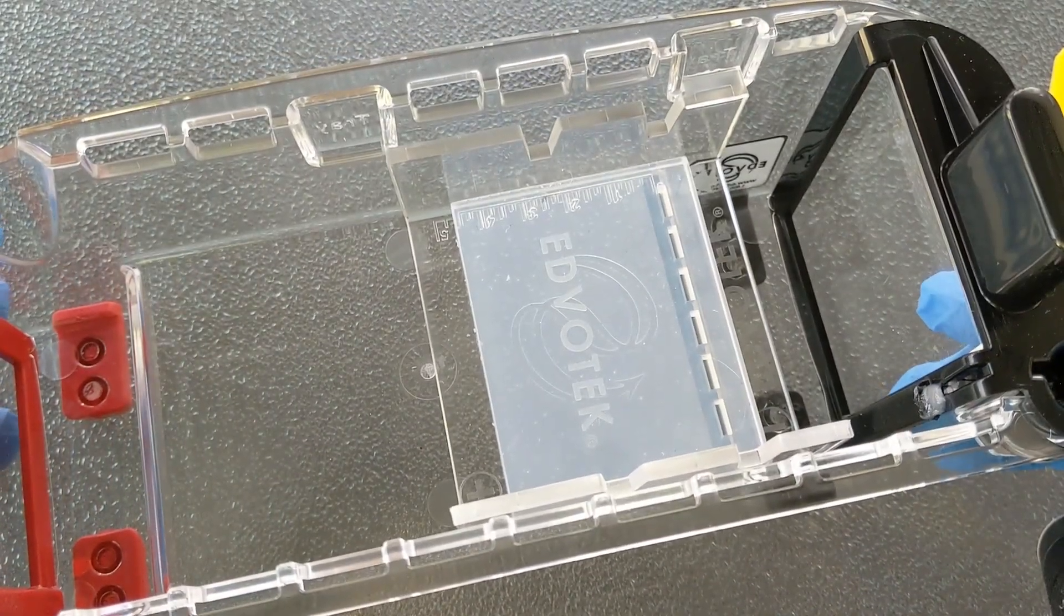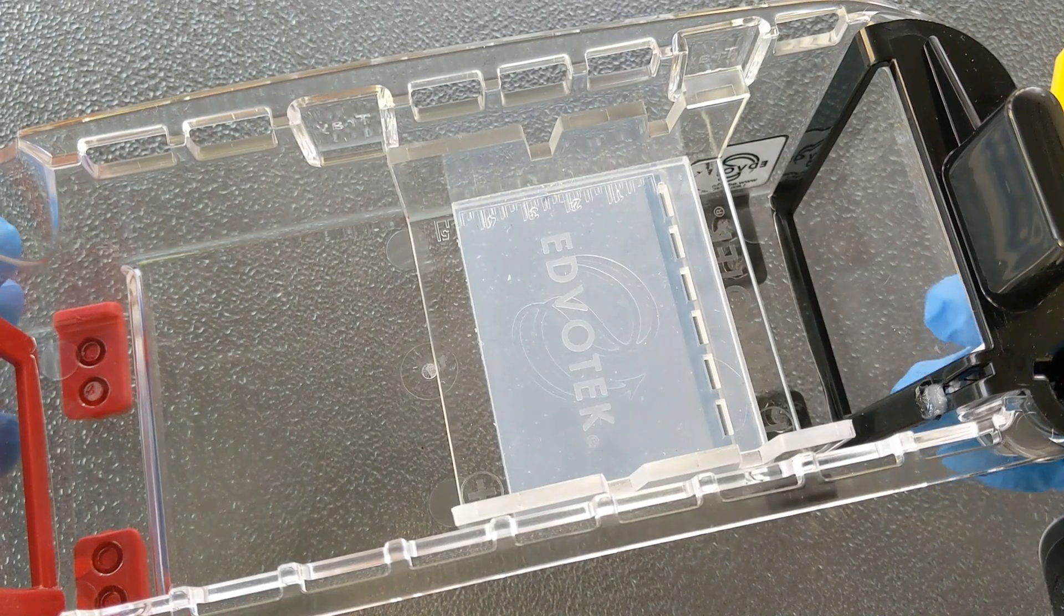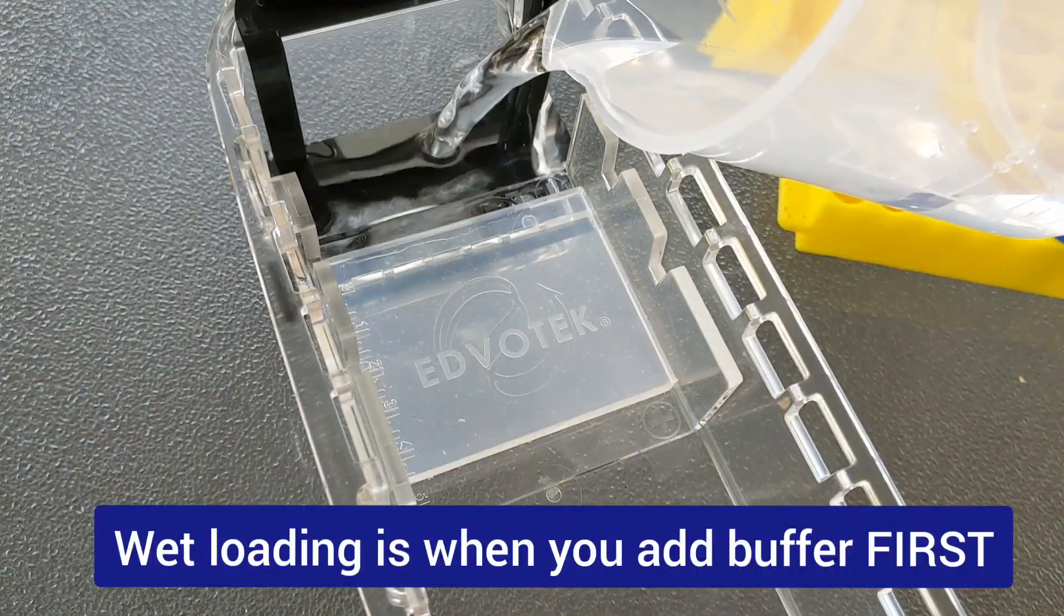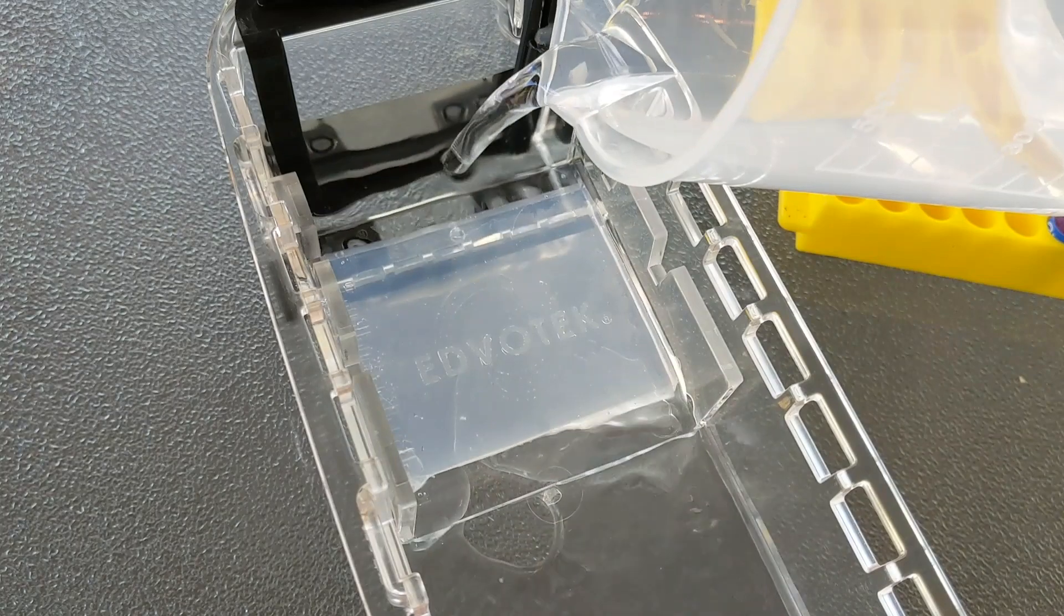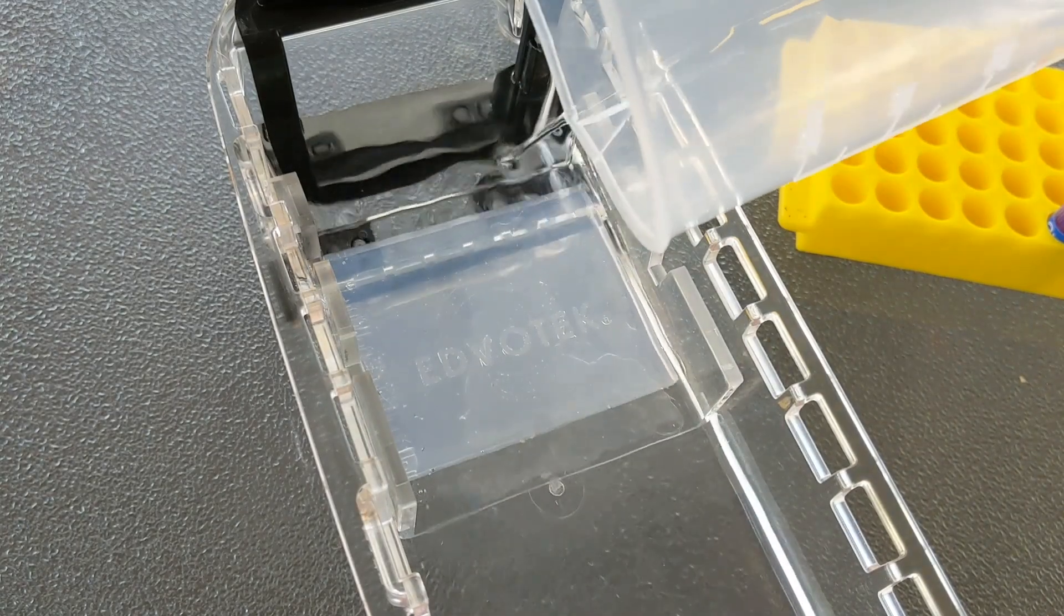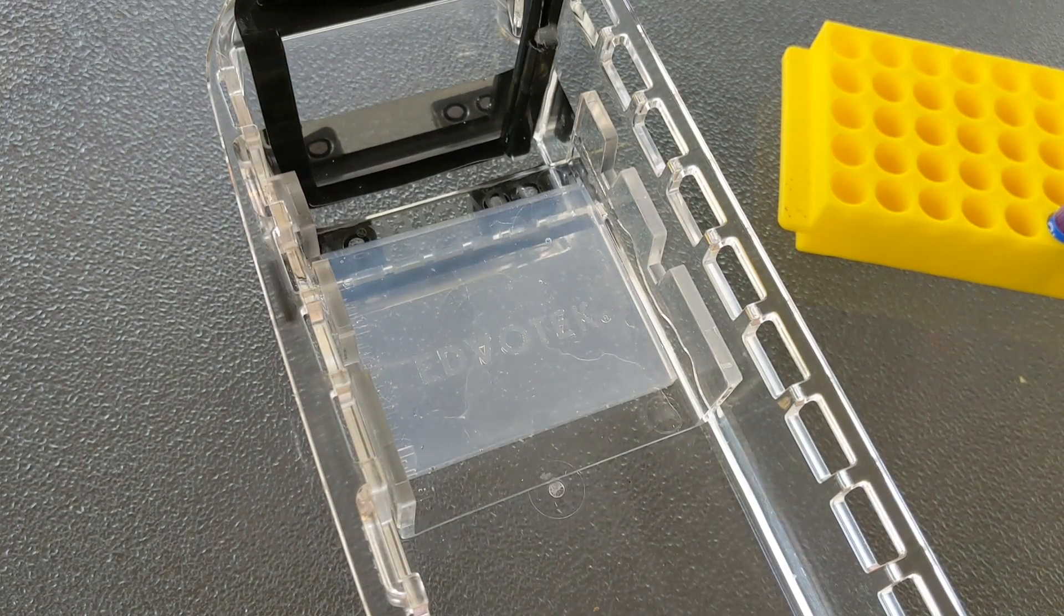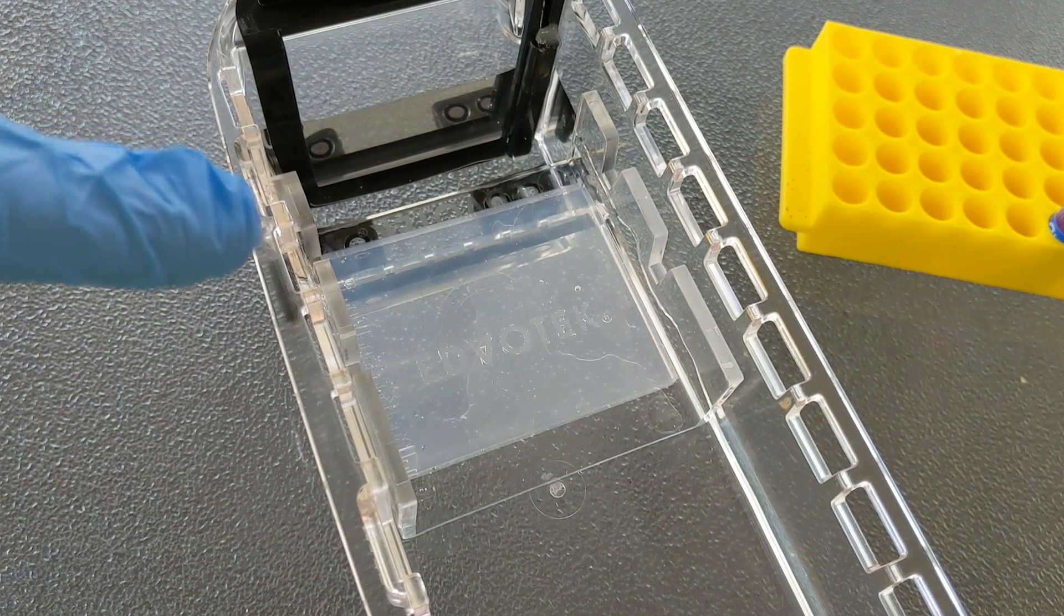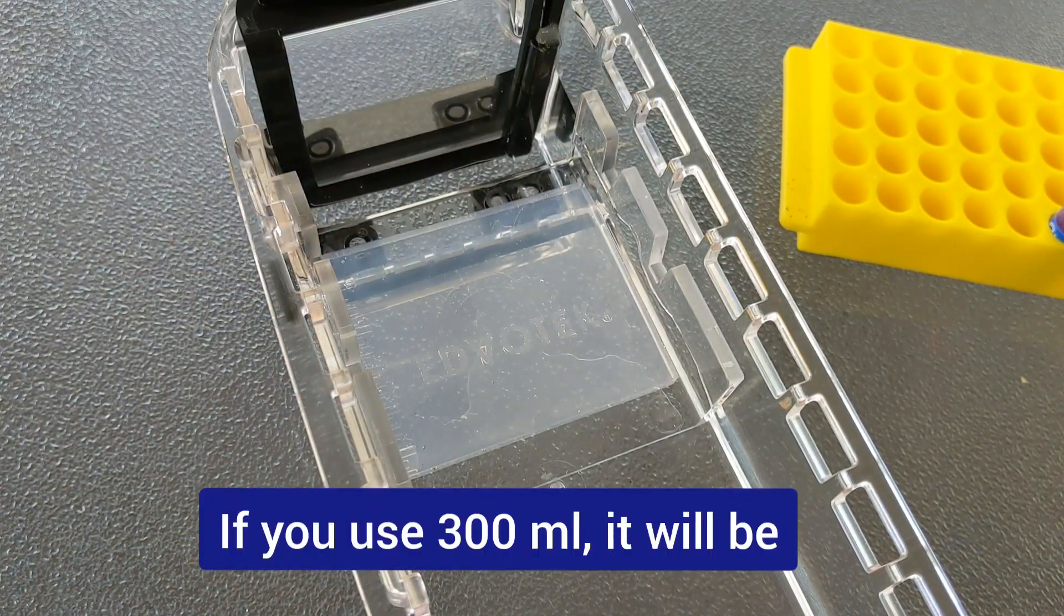I'm going to demonstrate wet loading first because wet loading is the method of DNA loading that I learned first. With wet load, you go ahead and add your buffer, so as soon as your gel is in there, you pour your buffer. It doesn't matter which side you pour it into, it's like a swimming pool, it's going to fully fill your chamber. And it's really important to make sure that your gel is immersed in the buffer and that the wells are totally covered.